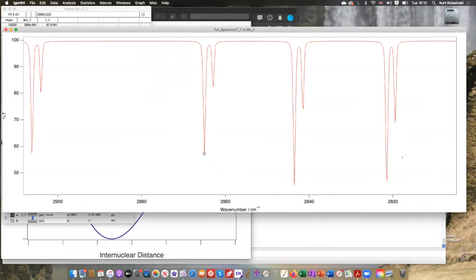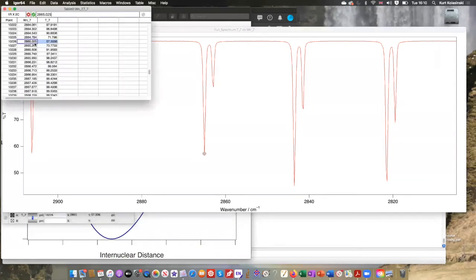So now we know that. And then we can go through each one of these and get the peak wave number value, right? Get it out there. Don't just take it to the wave number. You want at least 2 decimal places. 3 is really getting crazy. You need it to at least 2 decimal places. But hey, if you got the third one, why not take the third one, right?